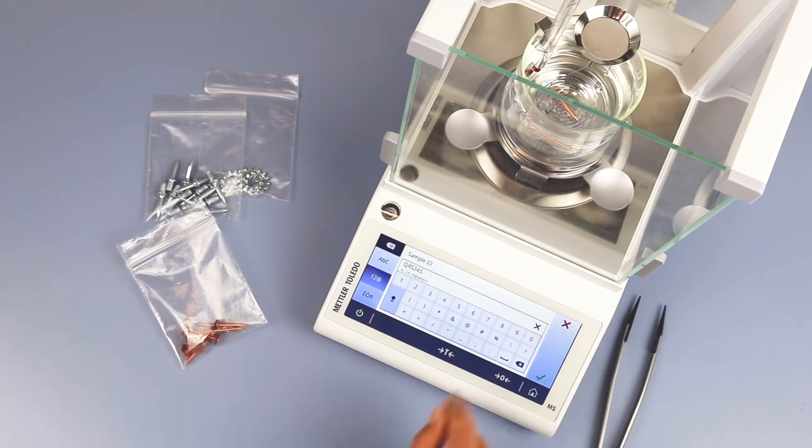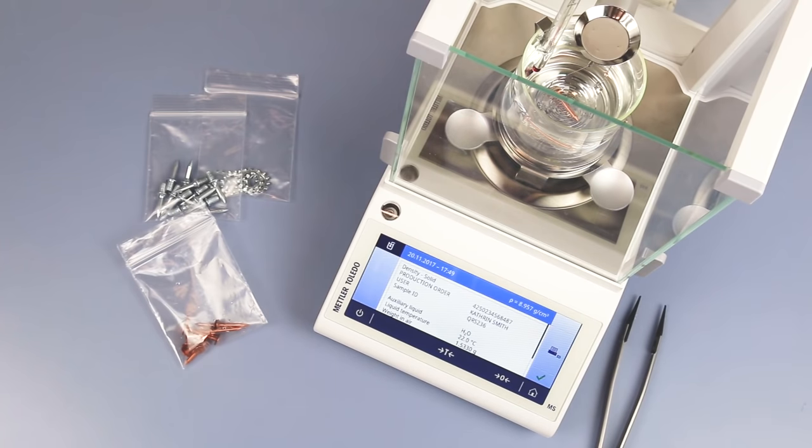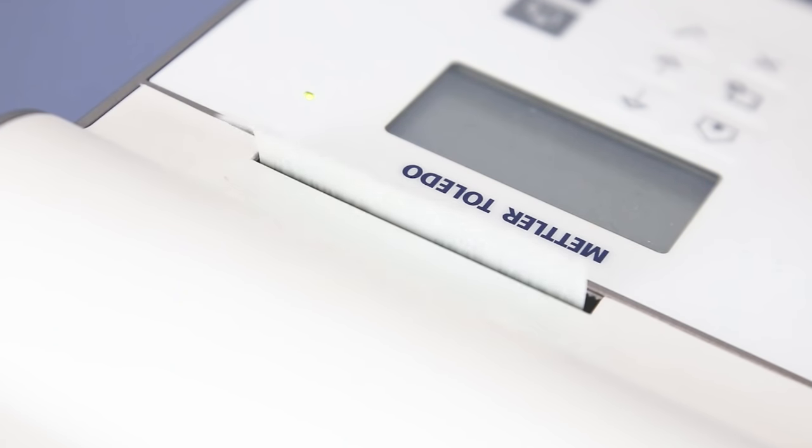It's possible to statistically evaluate multiple samples. All your results, plus up to four IDs and the time and date, can be either printed out or saved on a USB stick.